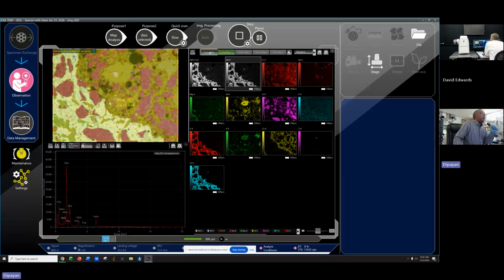Okay, because count map, net map, quant map, VCA, all these are the elemental maps, whereas cluster phase is a whole different ballgame. So I played with these, and even VCA sometimes gave me the best image. It can recalculate. So if I change this map, does it literally start everything all over again, like after I spend half an hour, if I decide to change?